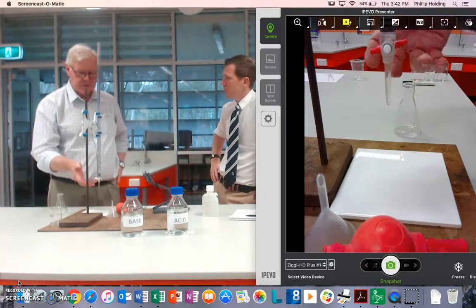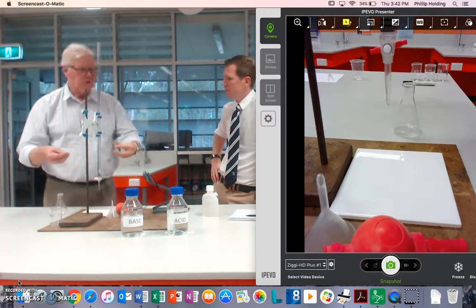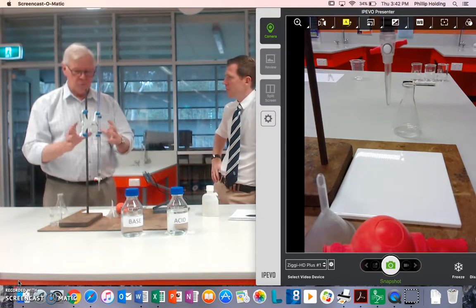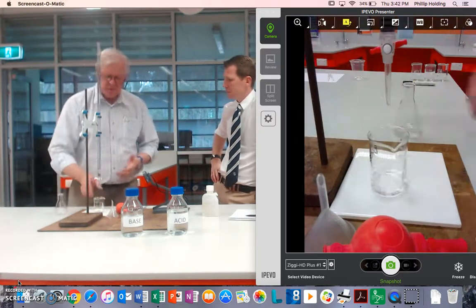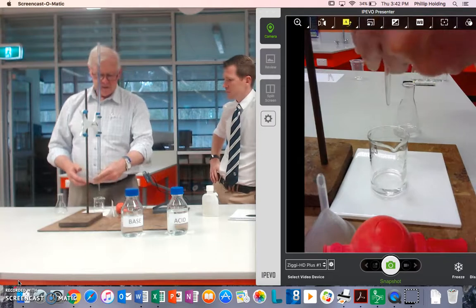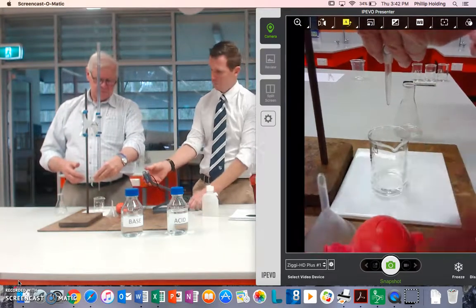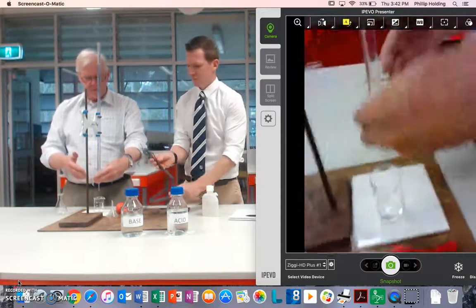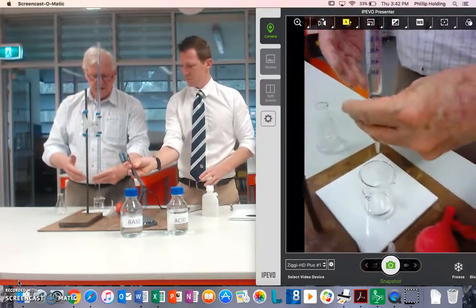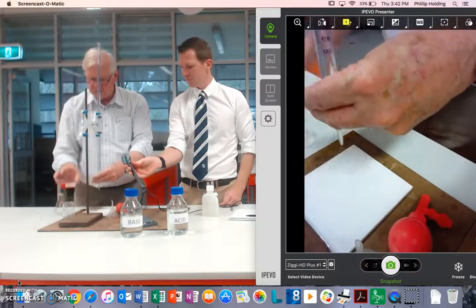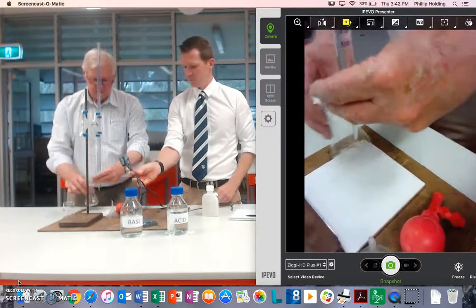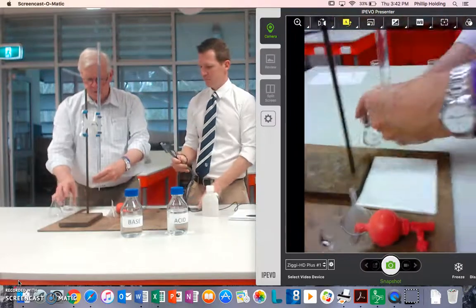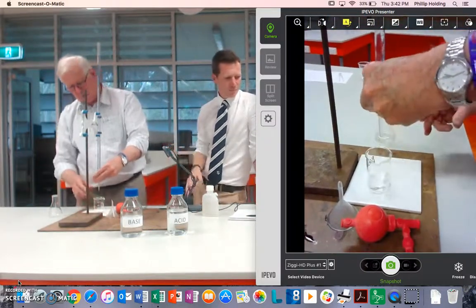And what happens is that you see all sorts of strange things. You see people working together as a team, whereas one person is meant to do it. So when I'm titrating, what I'm doing is I use one hand. I move the tap to the point where it's about to turn on, but I'm using my fingers and thumb on one hand because my other hand is for swirling when they start to react. So we need to practice at it first. It only takes a moment.